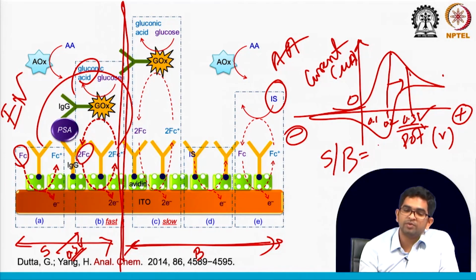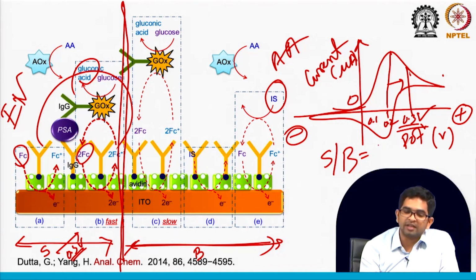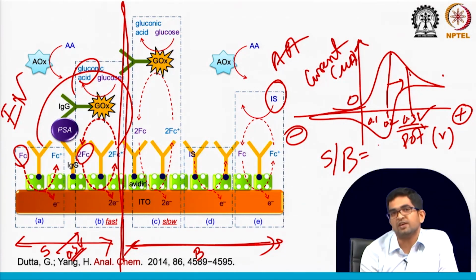So you have to eliminate those interference species effects at the beginning. So you have to think how to eliminate. One thing you have to understand is that the interference is present in your real sample first. Our blood sample contains ascorbic acid (AA).